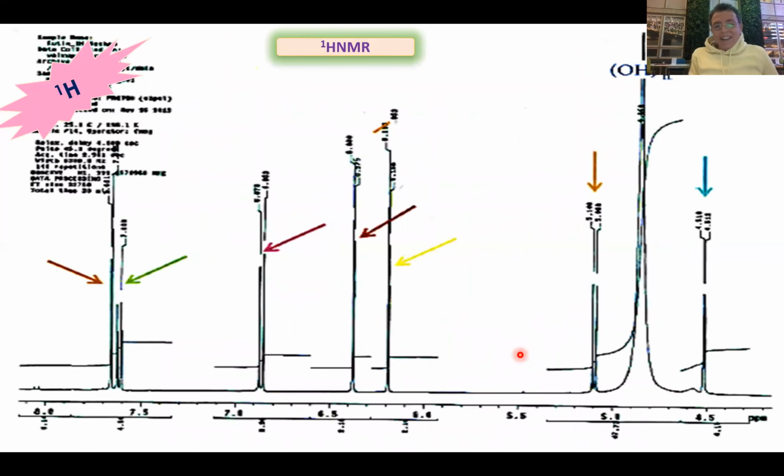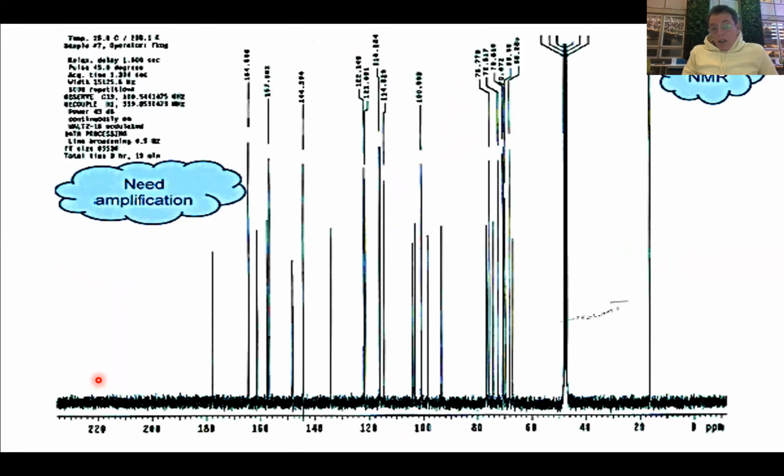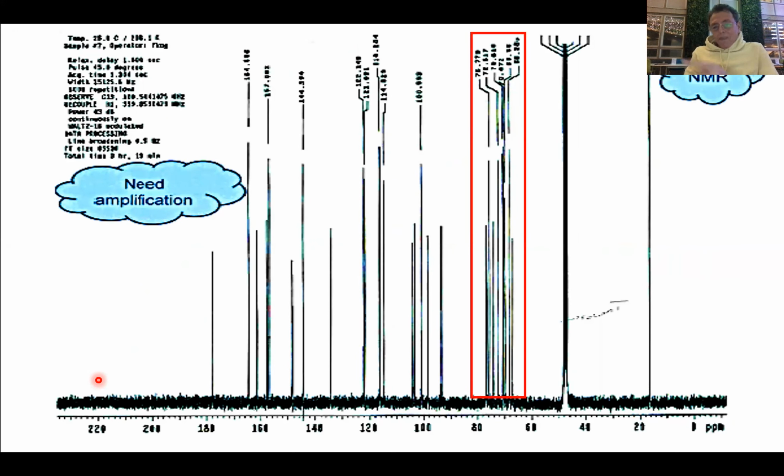Now we can go to another example of this, and this is a proton NMR. Now you can see also again that this is the aliphatic region with the anomeric, then it comes to the aromatic protons, and finally the flavonoid or the aromatic region started from here, right? So you can practice and see the assignment here by yourself, that it matches with all the rules we have been explaining before. Carbon 13, it comes, now I can hear you.